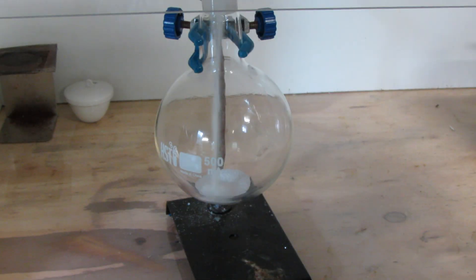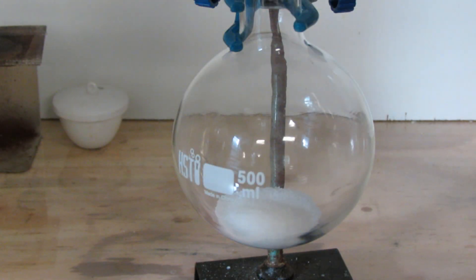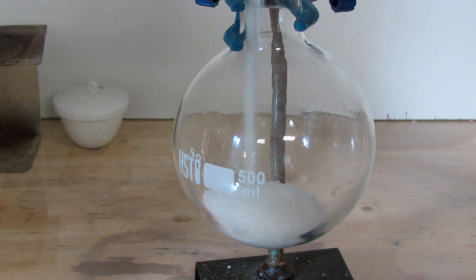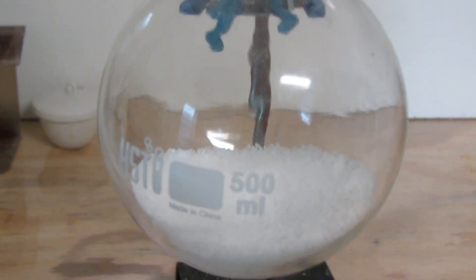Start by adding half of a mole of sodium chloride to a round bottom flask, then add a half of a mole of sodium hydrogen sulfate which is easily available as pH down to the flask, then mix the chemicals thoroughly.